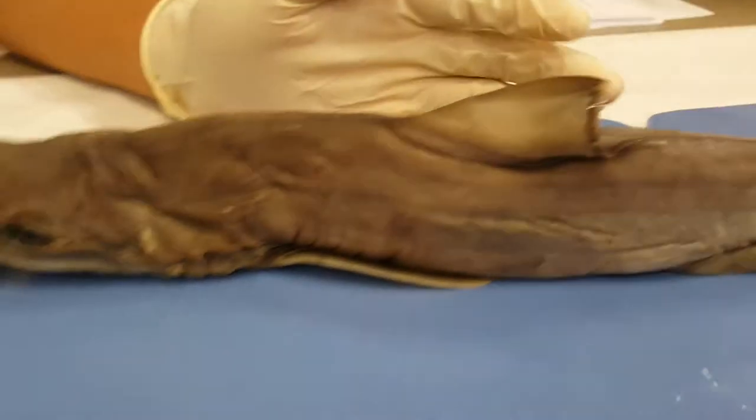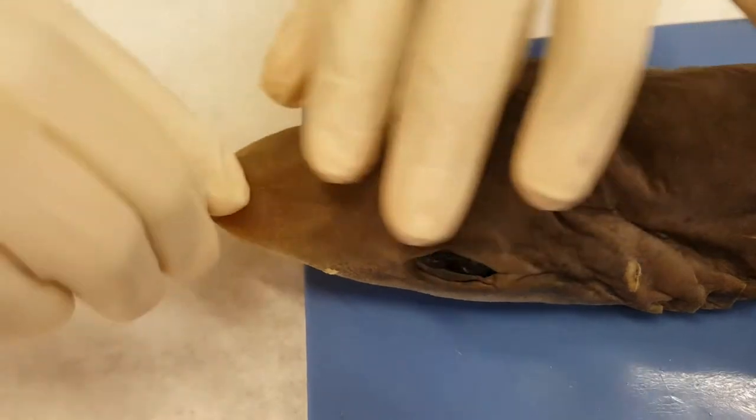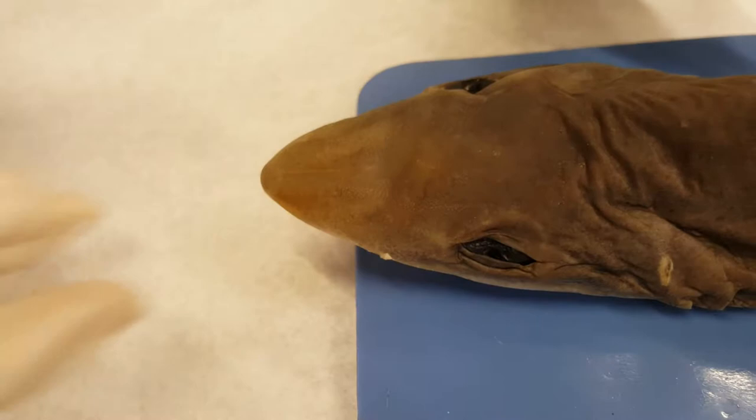After that we have the rostrum, which is basically the tip of the head — the nose. It's just to give it its figure.